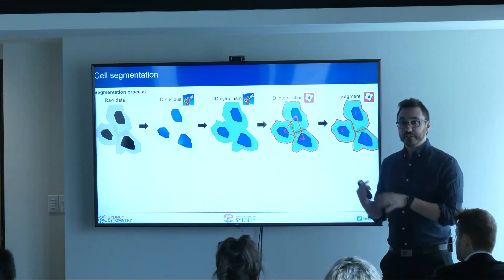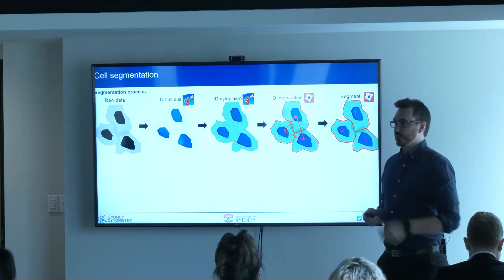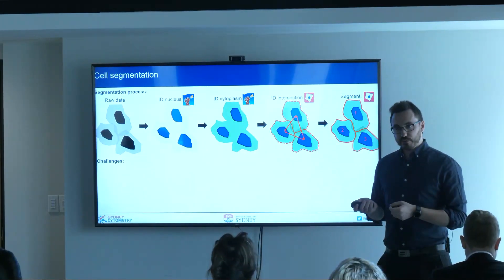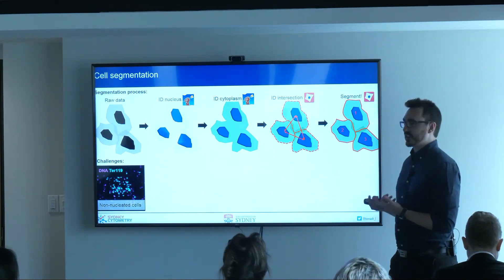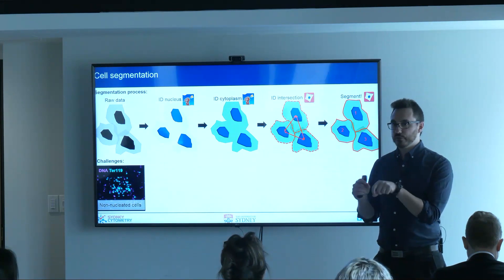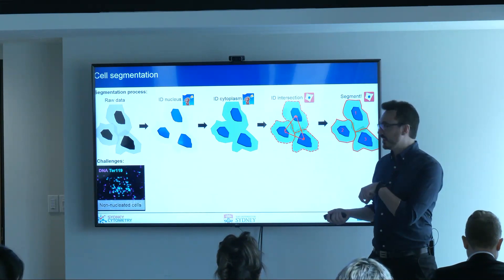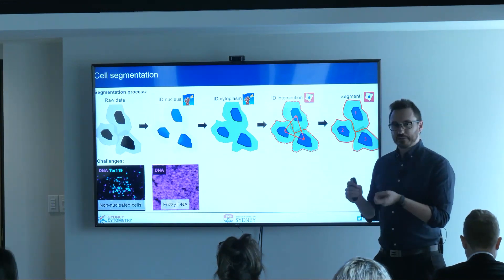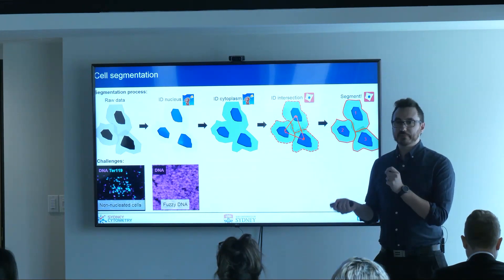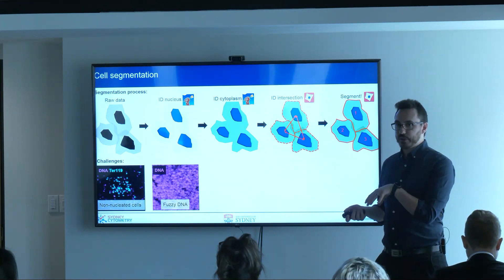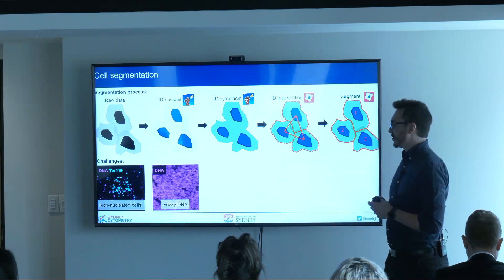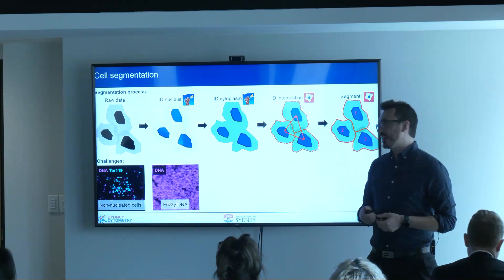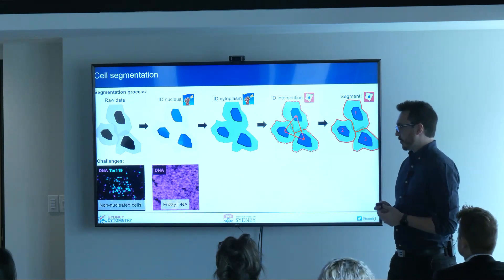The idea is we can segment the image into single cells, which is very helpful. But there are some challenges. If we have non-nucleated cells, any nucleus-based approach just falls apart — red blood cells, for example, or things like fuzzy DNA. If people are working in frozen sections, particularly in mouse tissues, we get this mess of nuclei which don't actually show up at all.